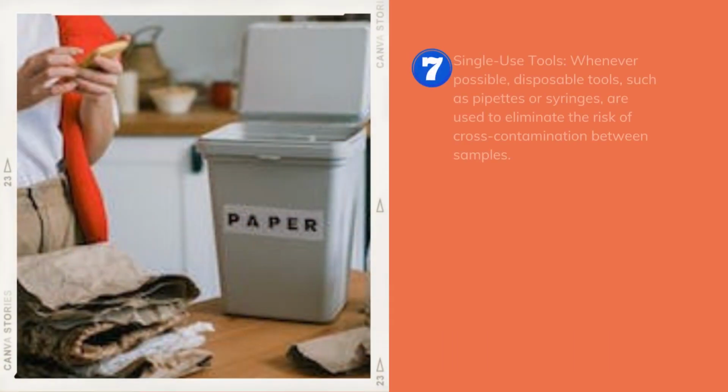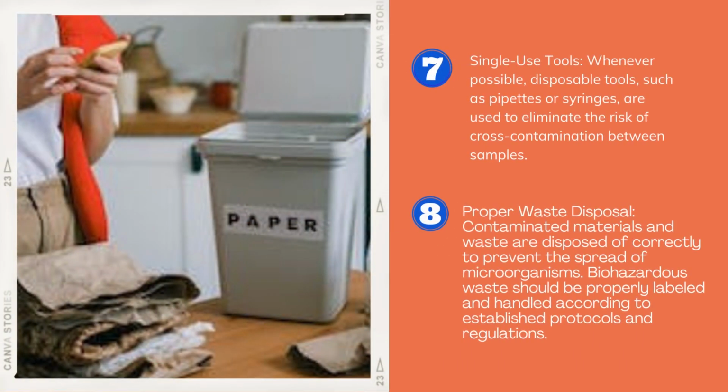Eighth, proper waste disposal. Contaminated material and waste are disposed of correctly to prevent the spread of microorganisms. Biohazardous waste should be properly labeled and handled according to the established protocols and regulations.